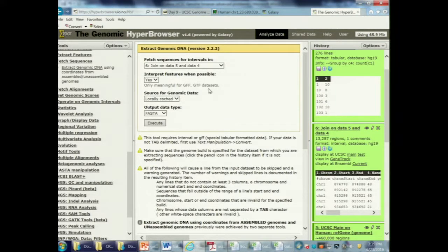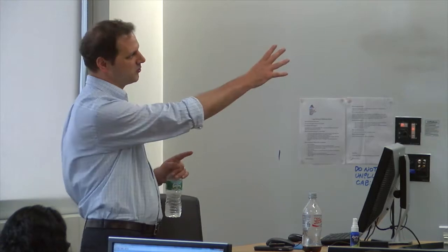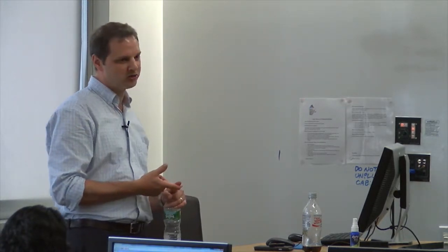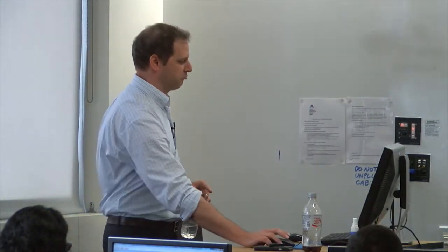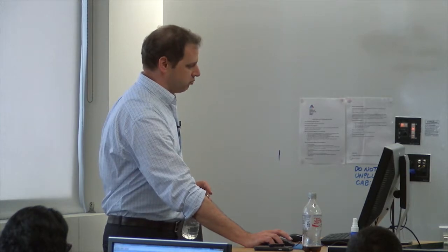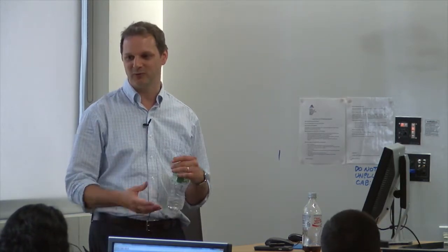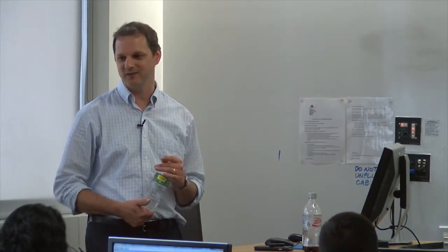Galaxy is really cool. Once you figure it out, I'd say there's 5 or 10 basic functions I use a lot. The two different types of join, the join on genomic intervals, the join based on common ID, group, merge, obviously uploading data. Those are the ones I use most, 5 different commands. And with a combination of those, often putting stuff in Excel, doing some custom sorts yourself, remove duplicates, you can do all kinds of interesting bioinformatics.